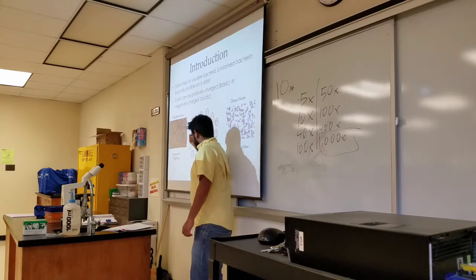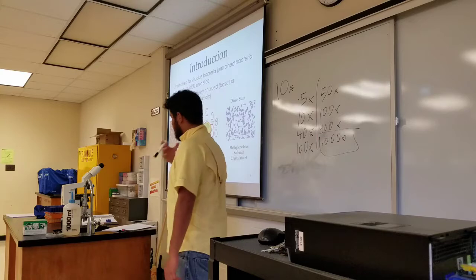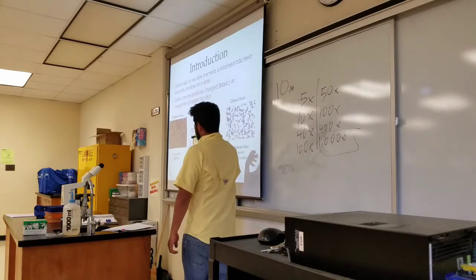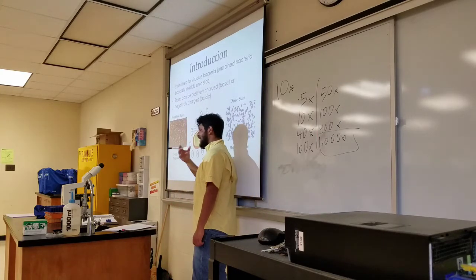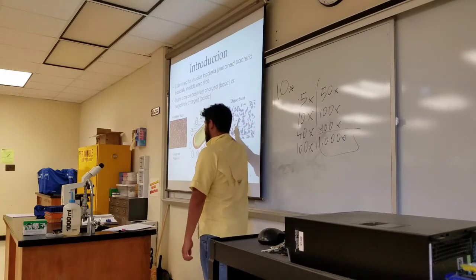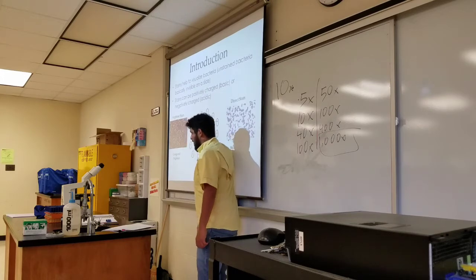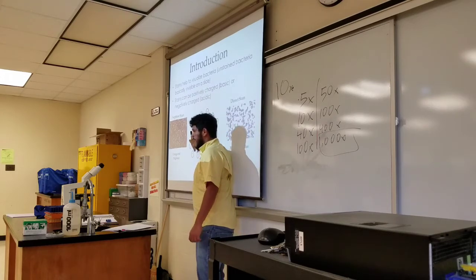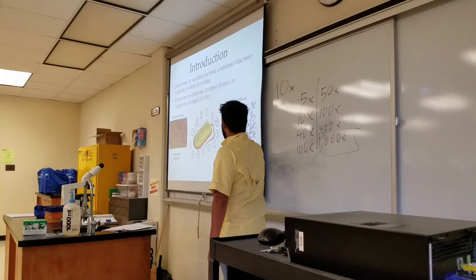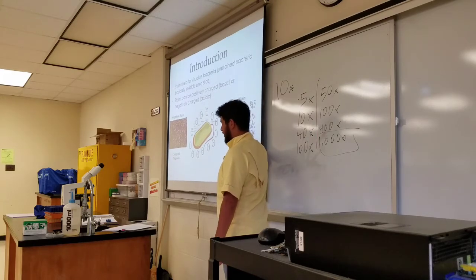Because of the composition of the cell wall or cell membranes, we usually have organic molecules that are negatively charged, or partially negatively charged, in our bacteria. When interacting with a positive stain, that stain tends to be retained around the bacterial cell wall and cell membrane, causing us to see the bacteria when we're staining them.